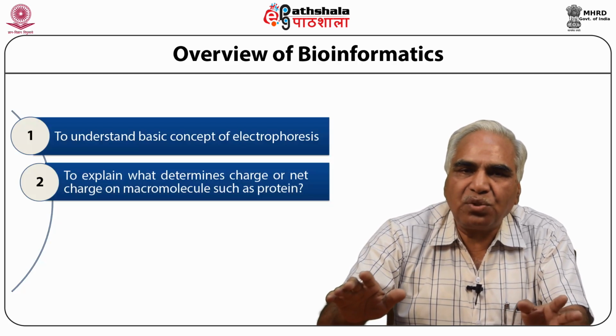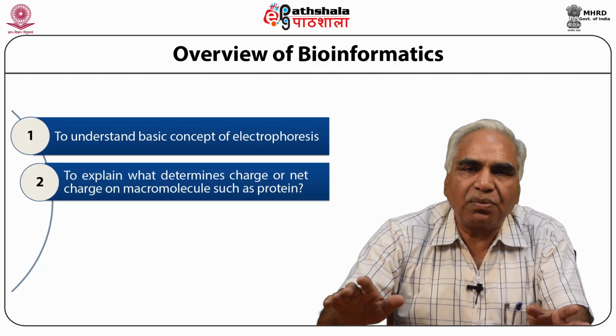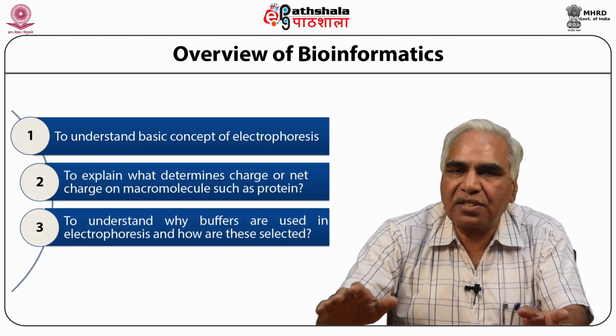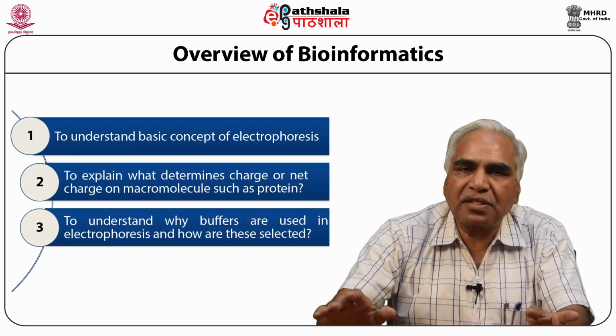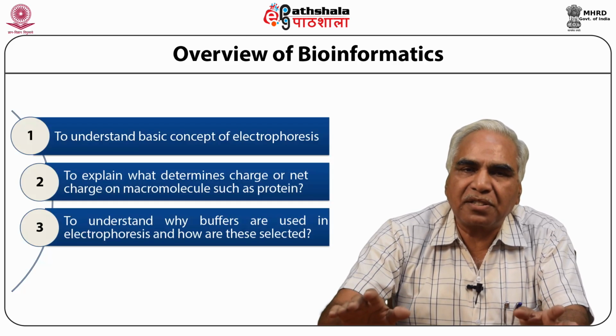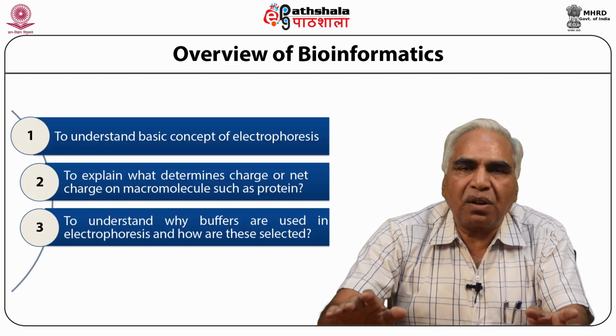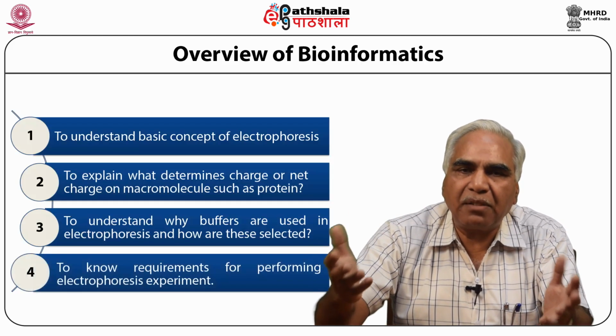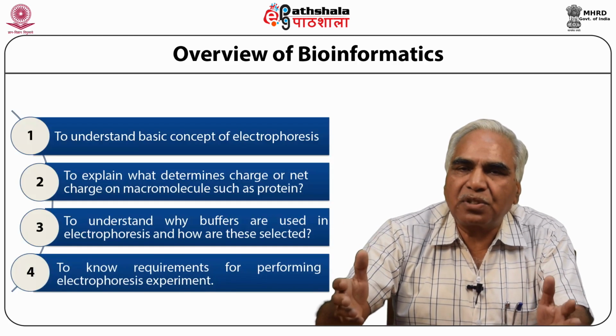As buffers are used during the electrophoresis of the protein, it is essential to understand buffers, how these buffers can be selected for the electrophoresis. These aspects are also covered in the presentation. Another objective of the presentation is to make you familiar with the requirement in performing electrophoresis techniques.